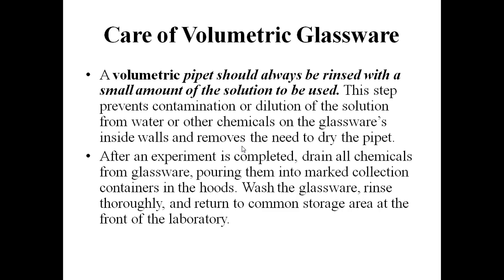Another thing for volumetric glassware is that a volumetric pipette should always be rinsed with a small amount of the solution to be used. This step prevents contamination or dilution of the solution from water or other chemicals on the glassware's inside walls and removes the need to dry the pipette. After the experiment is completed, drain all the chemicals from the glassware, pouring them into the marked collection container in the hoods. Wash the glassware, rinse thoroughly, and return it to the common storage area at the front of the laboratory.